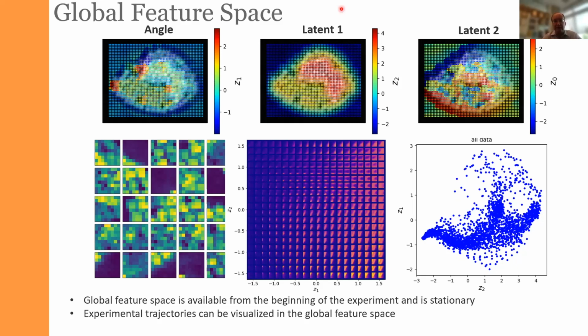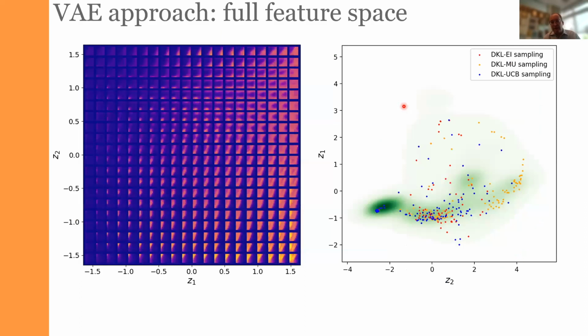And as I mentioned, the VAE is the foundation for more complex analysis. And this is exactly the example of how it works. Now, the interesting thing here is that we, of course, can choose the representation that we want. We can use the rotation invariant VAEs, we can use joint VAEs. It all depends on what specific problem you want to accomplish and what specific factors of variability you are interested in. And then the trajectory for each automated experiment essentially becomes a trajectory in the latent space of the full feature space.